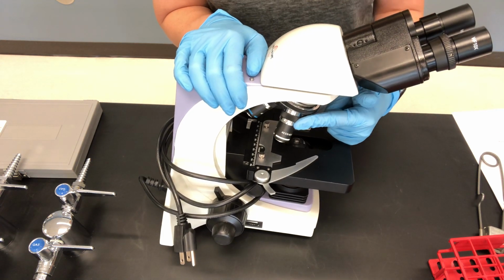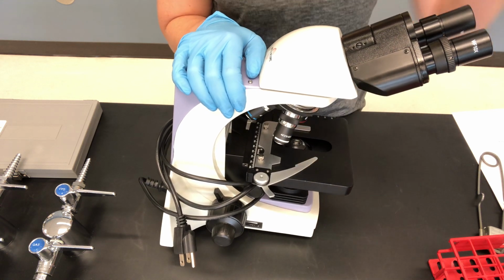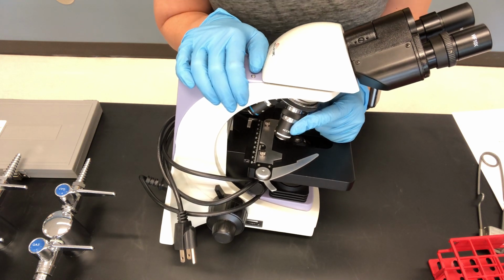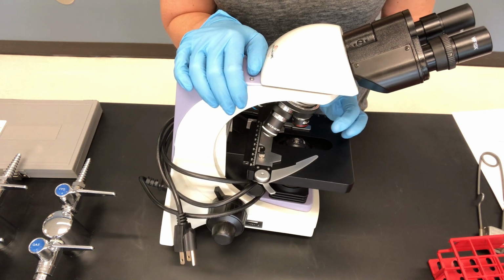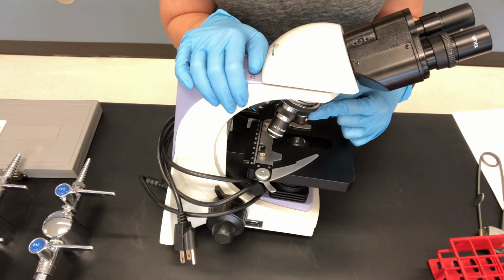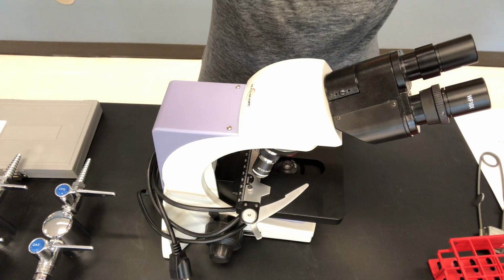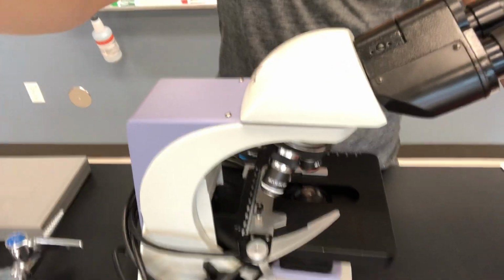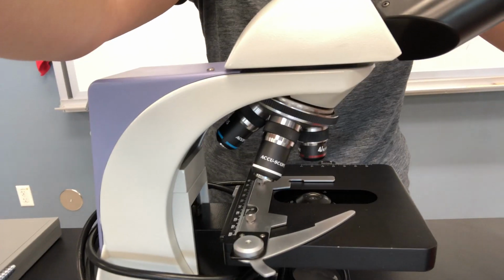So the highest magnification that we can get with our bacteria in this class is going to be 1,000 times magnification. And just to let you know, they're still going to be really, really small. So bacteria are super, super tiny. So those are our objectives, okay? And that's how we figure out total magnification, 10x eyepieces multiplied by the magnification of each of these objectives, okay? So let's do a quick tour. I think I'm going to change the angle of my camera here so you can see things a little bit more straight on.